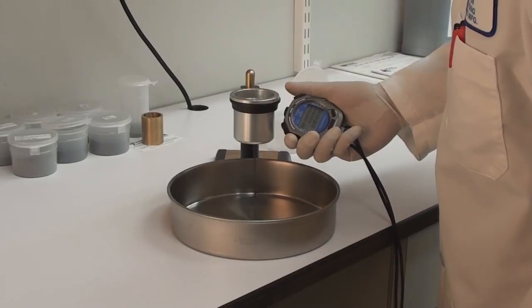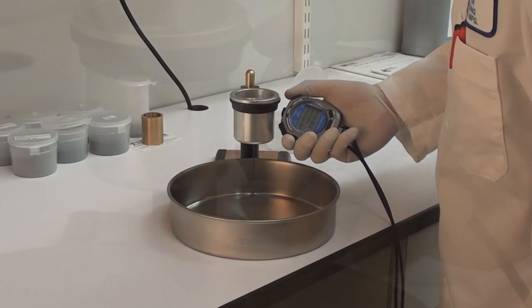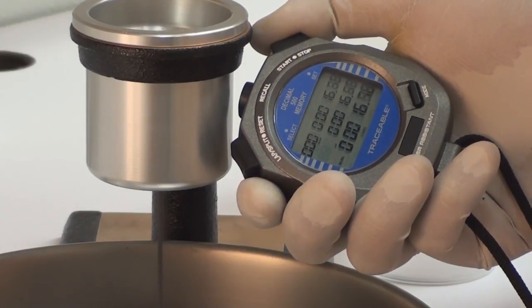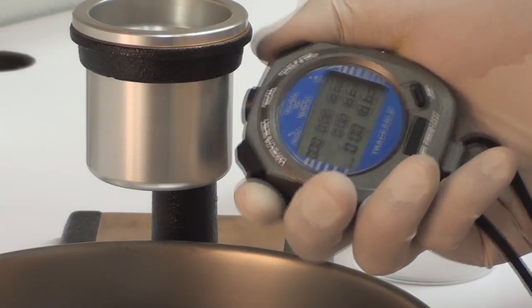The hull flow rate tells us how the powder will flow or behave in the hopper and powder feed line during the coating's process. It is measured by weighing a specific mass of powder and timing it as it flows through a hull flow meter's calibrated orifice.